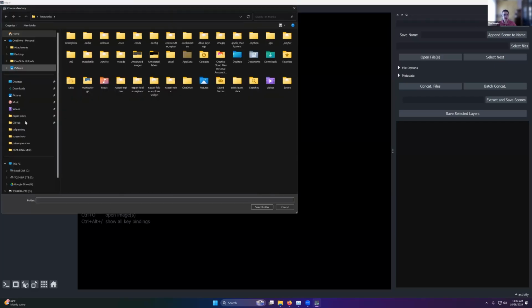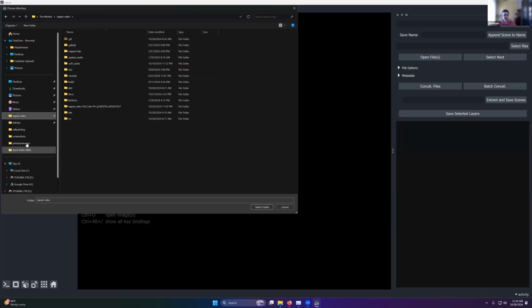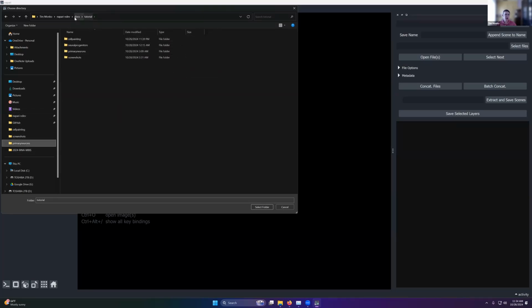So what we'll do is we'll choose our directory, for example, and I have them in this tutorial section. And then in this cell painting folder, what you'll end up having is these images. Oops, where did they go? Oh, that's right. I'm trying to select the directory. There you go.